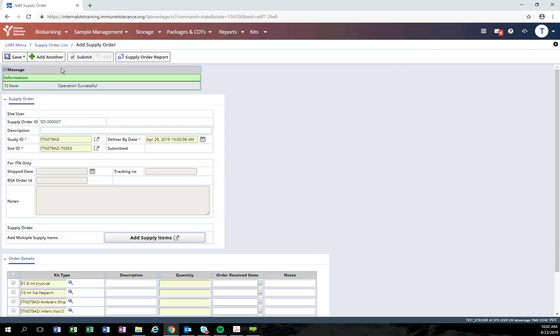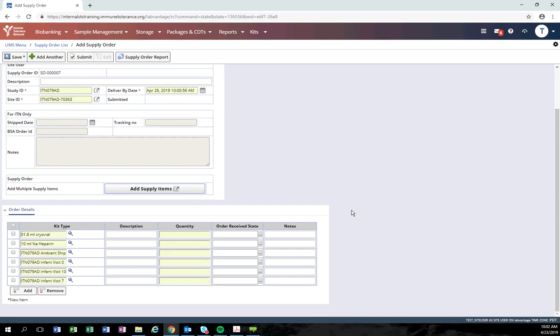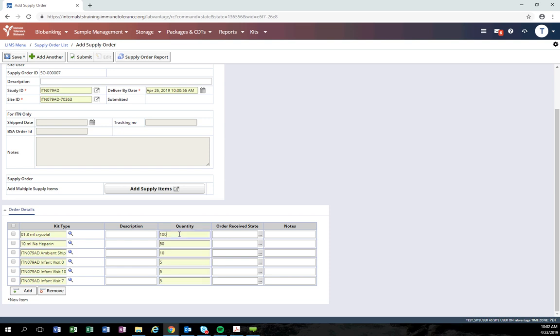Once done clicking all of the items for your order, click the select return button. This will add the items to your order details table. Now enter the quantity needed for each individual item. Clicking the enter button on your keyboard will advance to the row below. After entering all the items needed, click the save button.